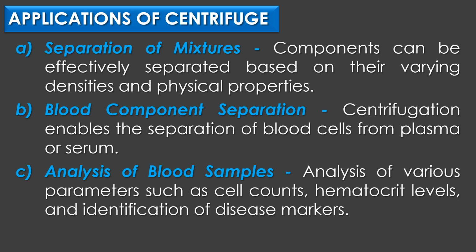The second application of the centrifuge is blood component separation. One of the essential applications of centrifuge in the medical field is separating blood components. Centrifugation enables the separation of blood cells from plasma or serum, which is crucial for various diagnostic and analytical procedures.